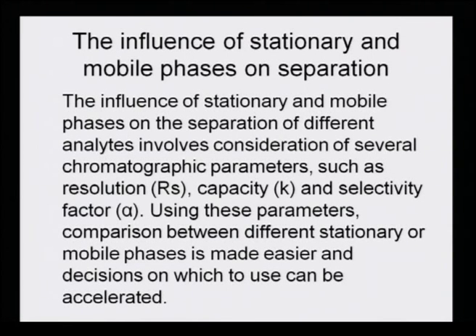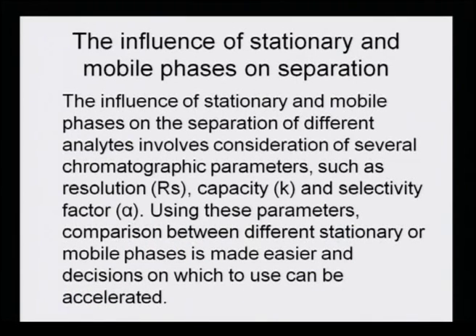The influence of stationary and mobile phase on separation. The entire chemistry of separation relies on how the stationary phase and the mobile phase react towards the extract. The better the extraction, the better the reaction between the extract and the mobile phase and stationary phase, the better will be the separation. The influence of stationary and mobile phases on the separation of different analytes involves consideration of several chromatographic parameters such as resolution, capacity and selectivity factor.